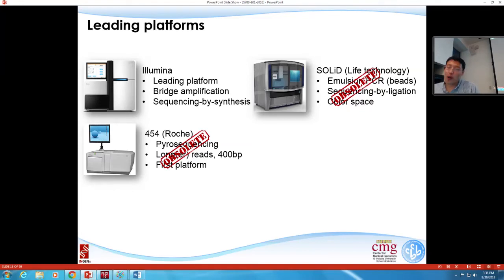That's how things work. And the third one I want to mention a little bit is the 454 technology. It was purchased by Roche. It's based on pyrosequencing technology, and at one point it could sequence 400 to 800 bases. The reason I still want to mention it is that it was the first next generation sequencing technology ever put on the market. The first platform came in 2006, 12 years ago. Now they are being out-competed. I don't think there are any platforms available for that.